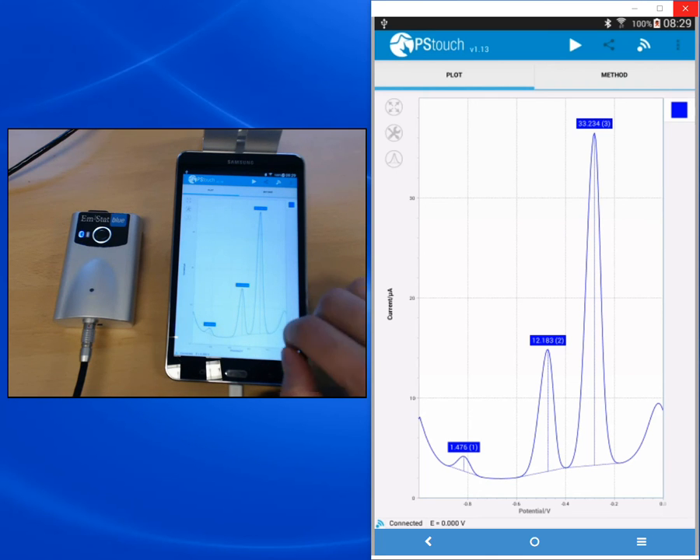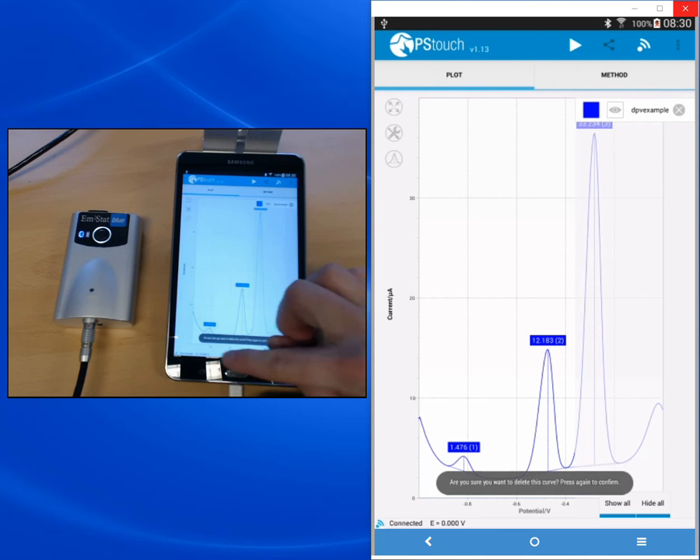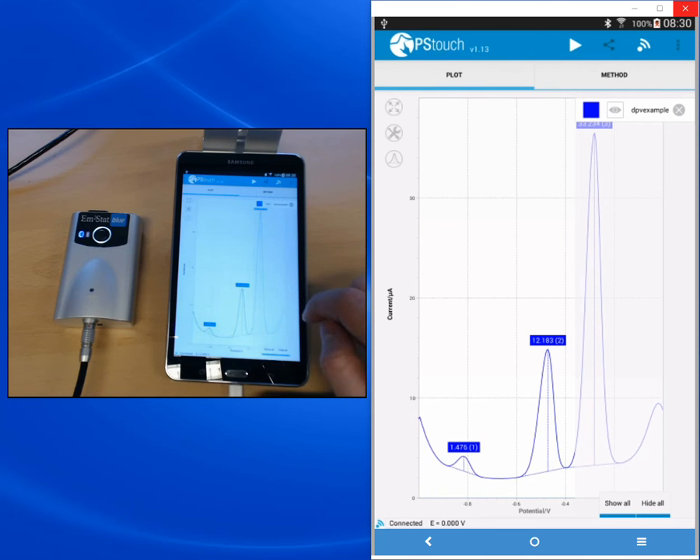To operate the legend, you need to drag it out from the right — swipe from the right edge to the center. In the legend you see the color of the curve, its name, and icons to manipulate it. The eye icon lets you hide or show the curve by tapping it. At the bottom you have buttons to show all or hide all curves. The X next to a curve allows you to delete it, but again a confirmation is required to prevent accidental data loss.